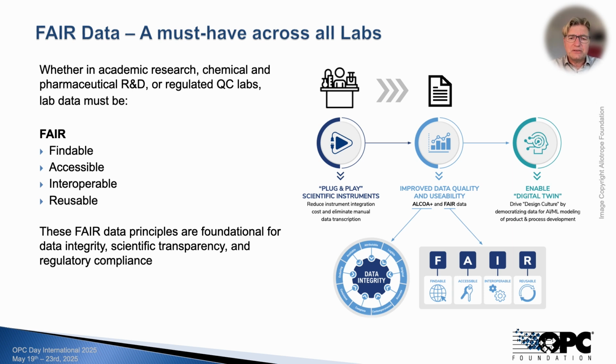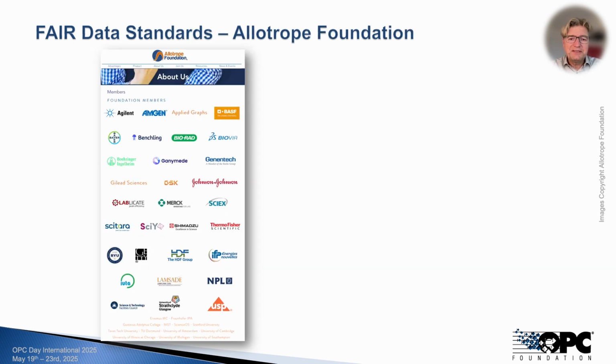So what does FAIR actually stand for? Findable, accessible, interoperable, and reusable. Together, these principles support not only data quality, but also data integrity, both of which are now expected in any digital lab environment. Let me briefly introduce the Allotrope Foundation, a cross-industry consortium that has been pioneering cutting-edge data standards for FAIR laboratory data.